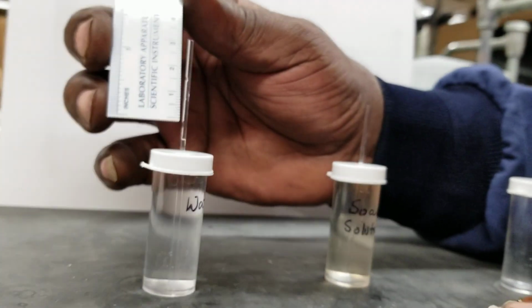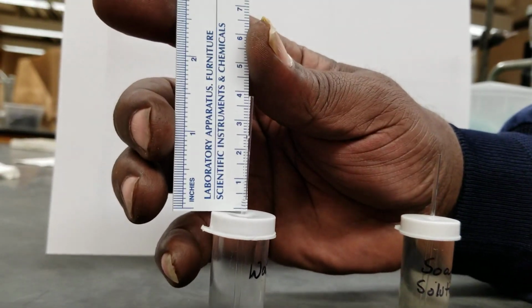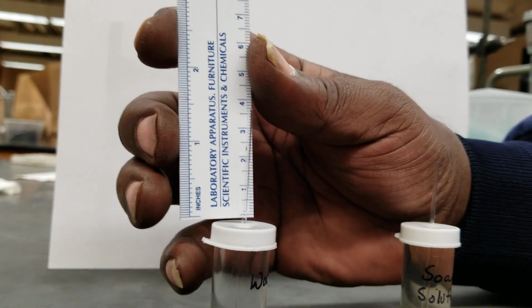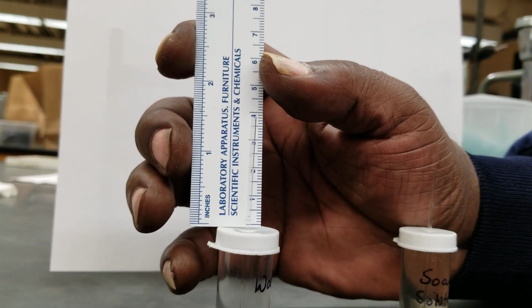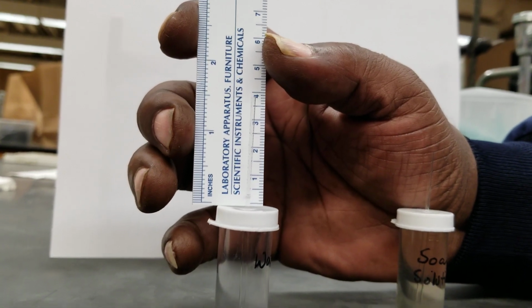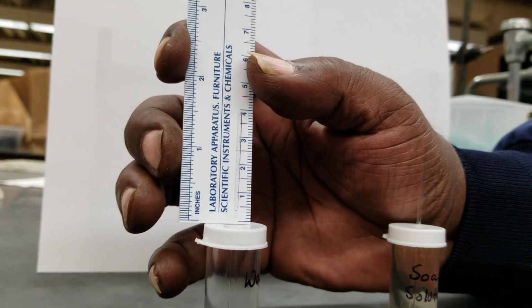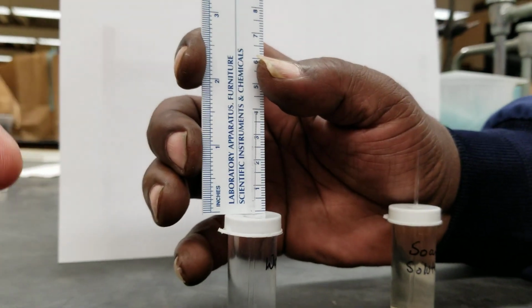And then last but not least, good old H2O. Just touch there. I'm going to call that what? 5 millimeters? Let's call that 5 millimeters.